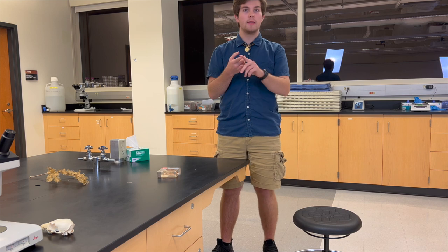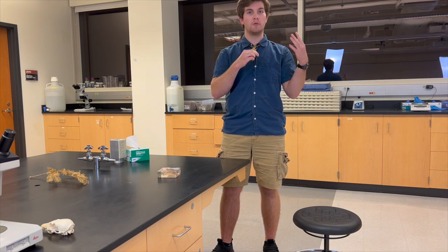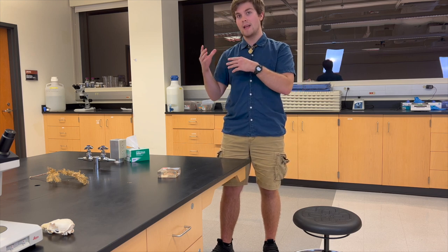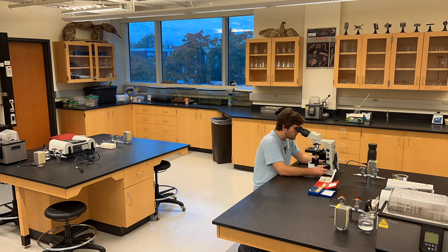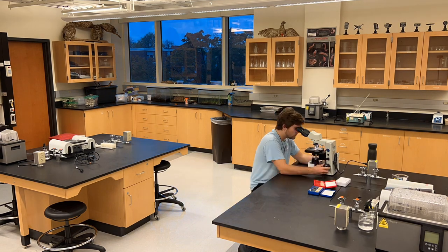Now that you know how to operate both the compound microscope and the dissecting scope, which covers topics such as being able to focus on a slide from 4x to 40x, as well as differences between trans-illumination and epi-illumination, the best way to hone your skills in lab is to practice. Spend some time looking at specimens under both microscopes. Even bring in some specimens of your own that you'd like to examine under the scopes. Finally, if you have any questions concerning the content of this video, please reach out to your professor or your TA, and they will be happy to assist you. I hope this video helps you as you begin working with the dissecting and compound microscopes, and I'm sure I'll see you in lab.